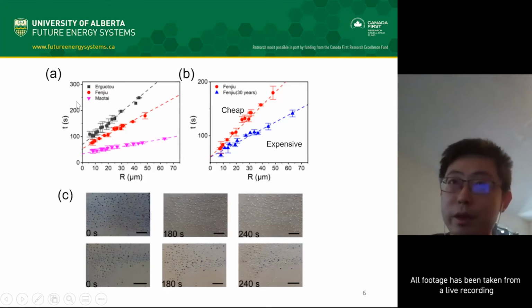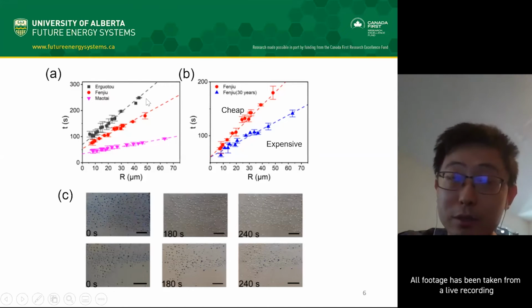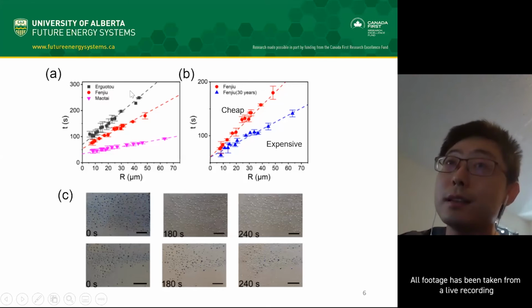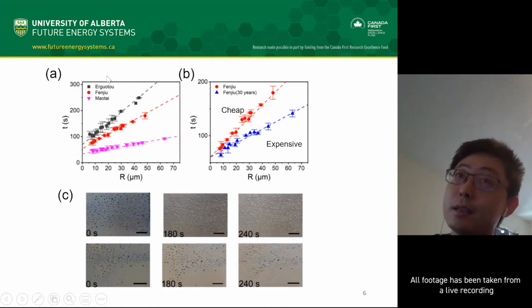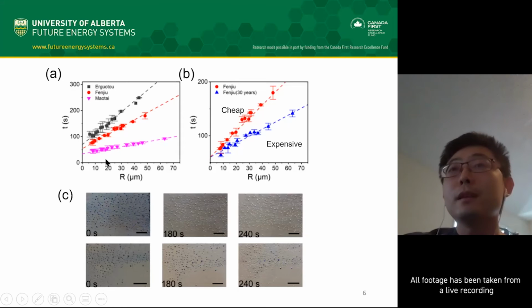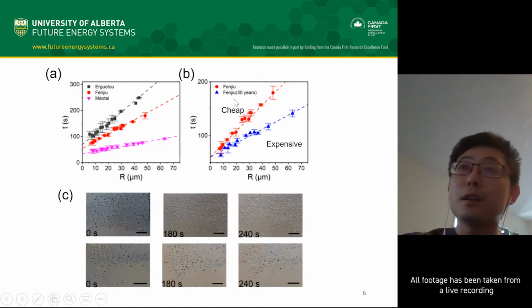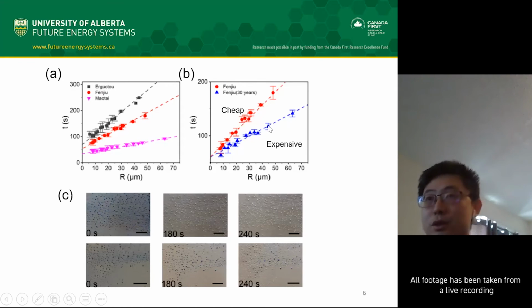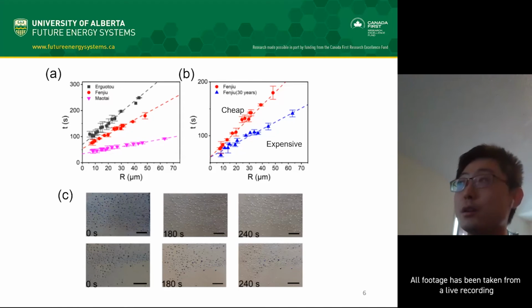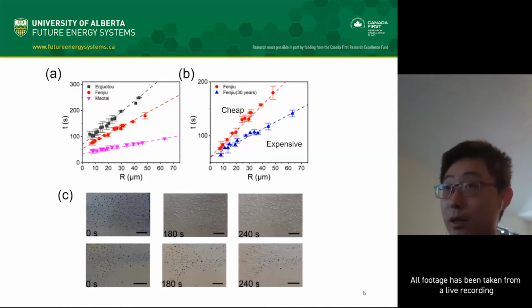Here we use three famous Chinese spirits. Chinese spirits contain thousands of families of organic acids. We find that those spirits have the same pH value, but with our method we can distinguish them by their different curves. Also, for the same brand, we can distinguish the cheap one from the expensive one, which allows us to identify counterfeit alcohol.